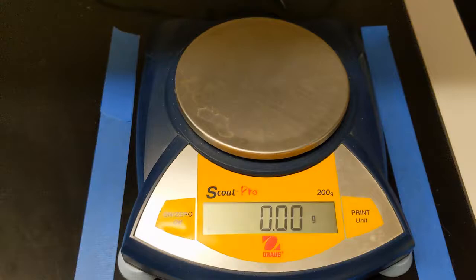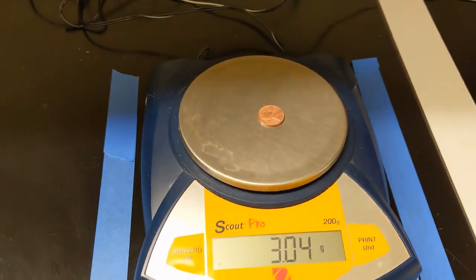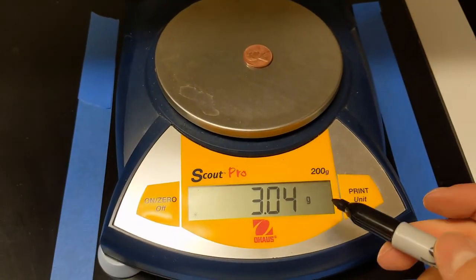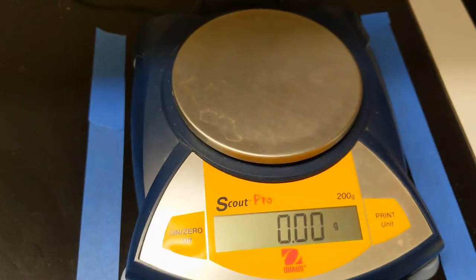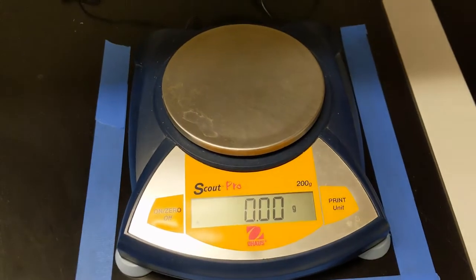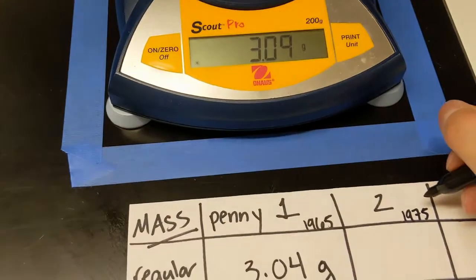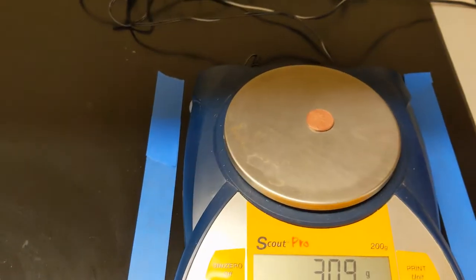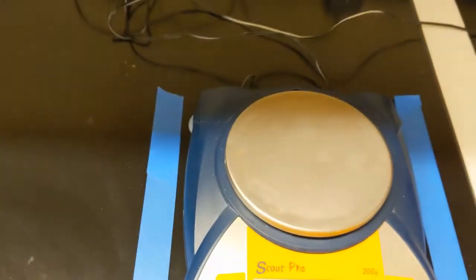I'll start measuring my pennies now. On top. So that's 3.04 grams, so notice that it's in grams. And this is my penny from 1965. Let's repeat for the other pennies. All right, so this is a penny from 1975. There we go. Go ahead, take these measurements along with me. And this is 3.09 grams. All right, let's do our final penny.